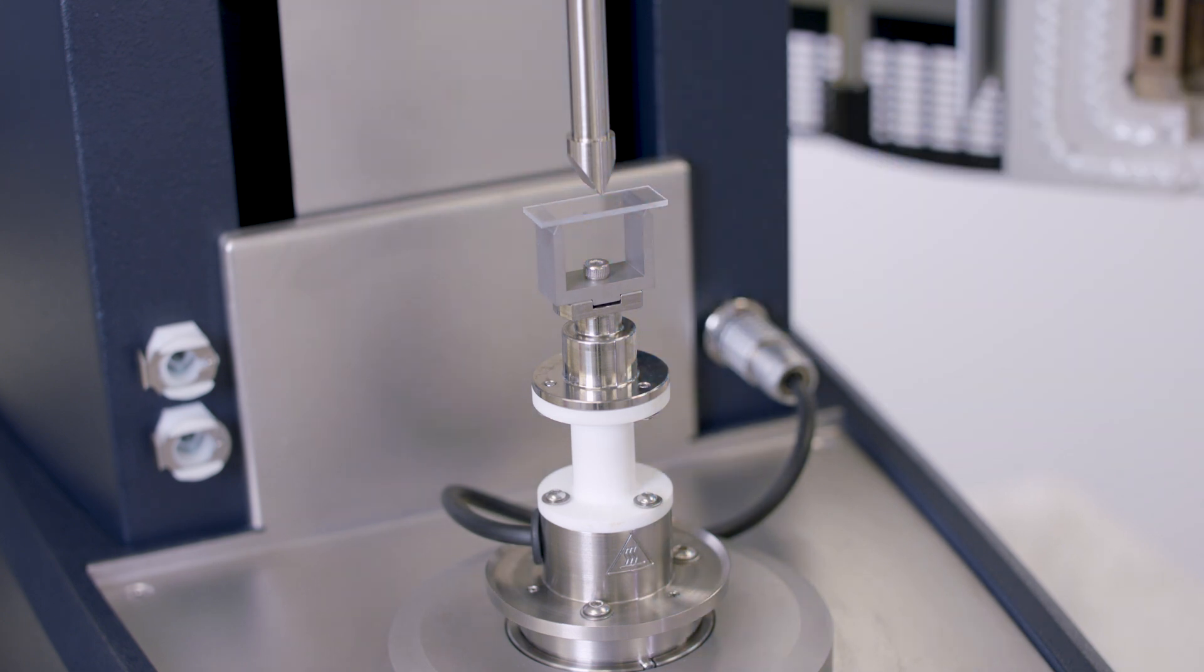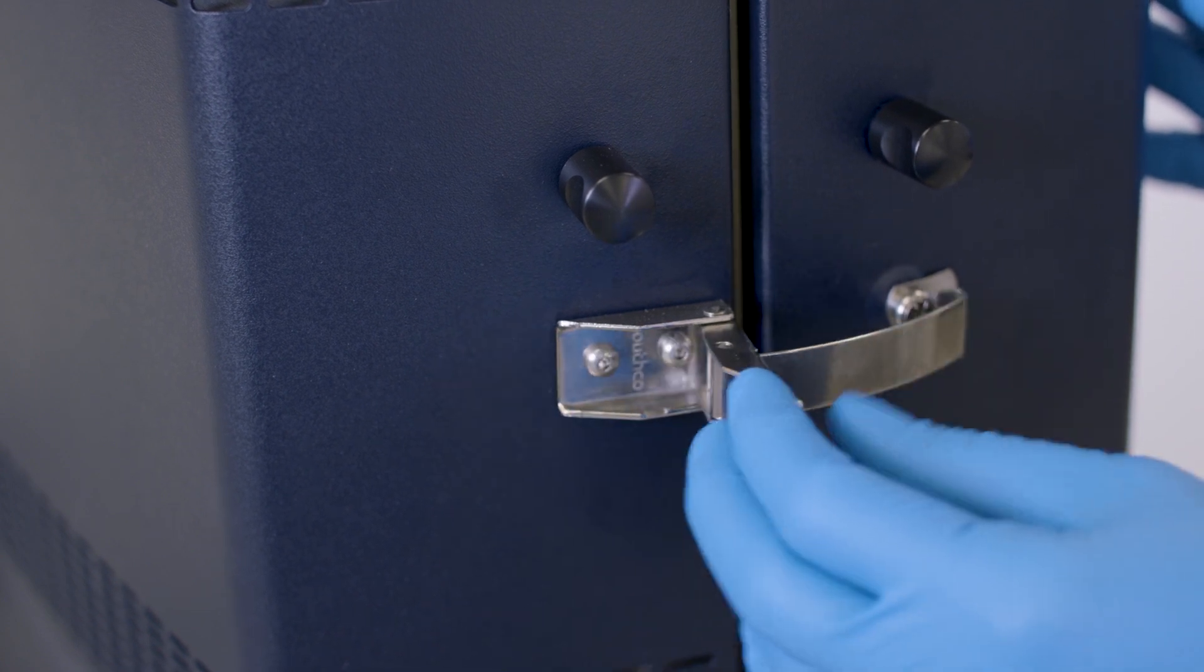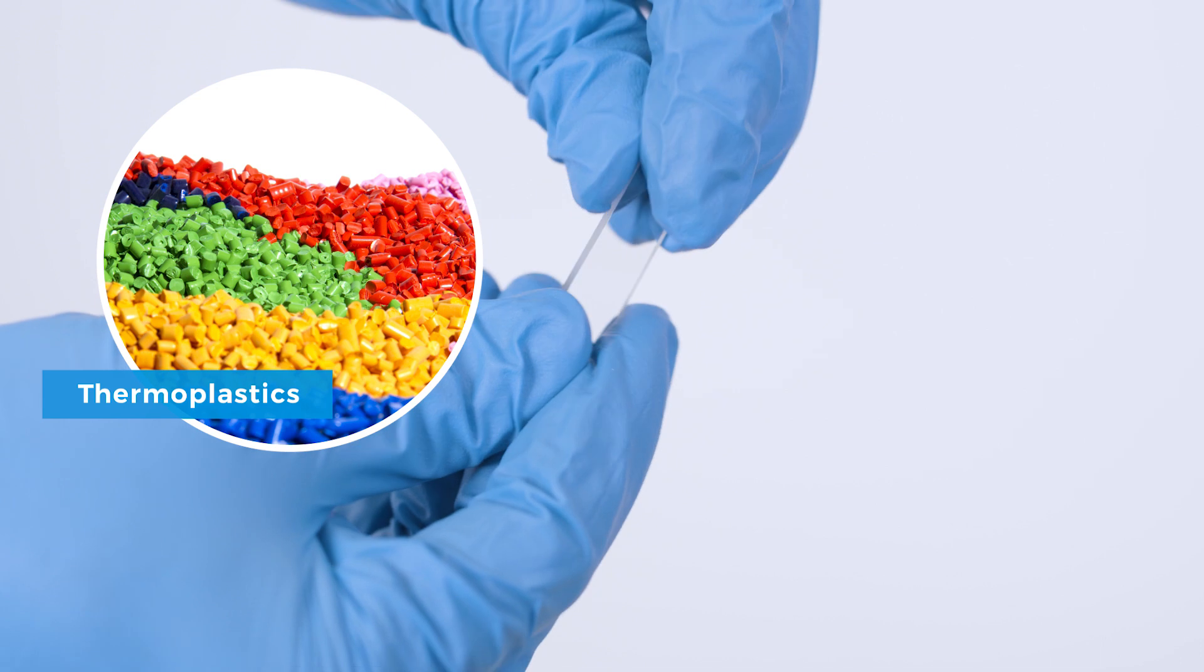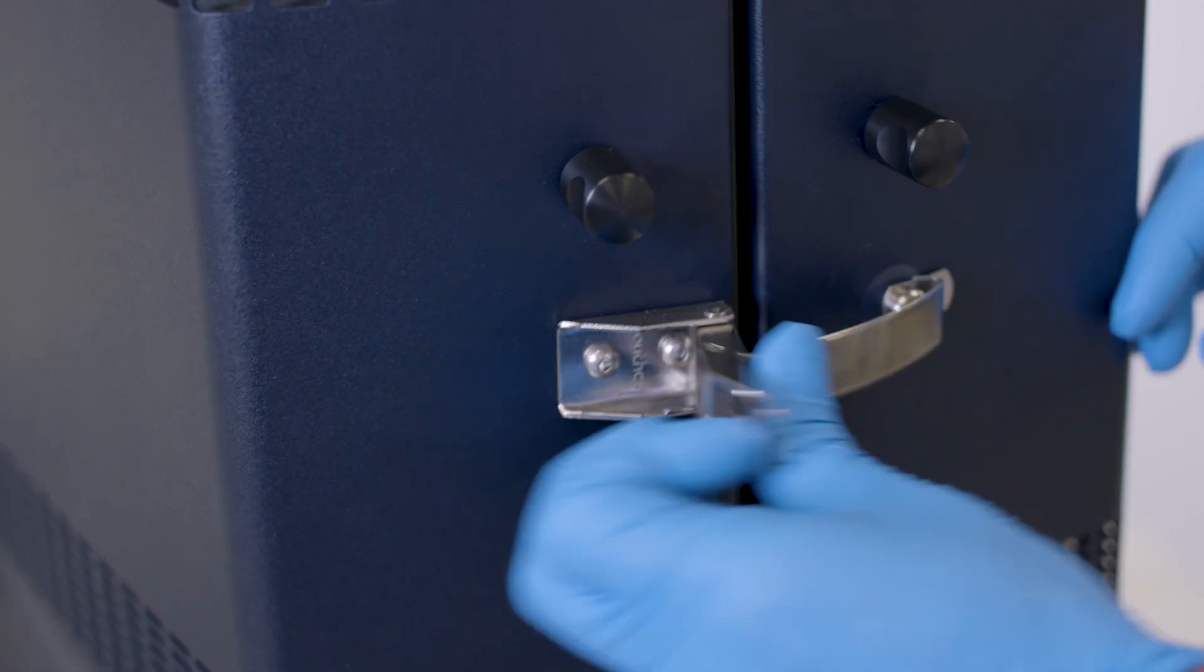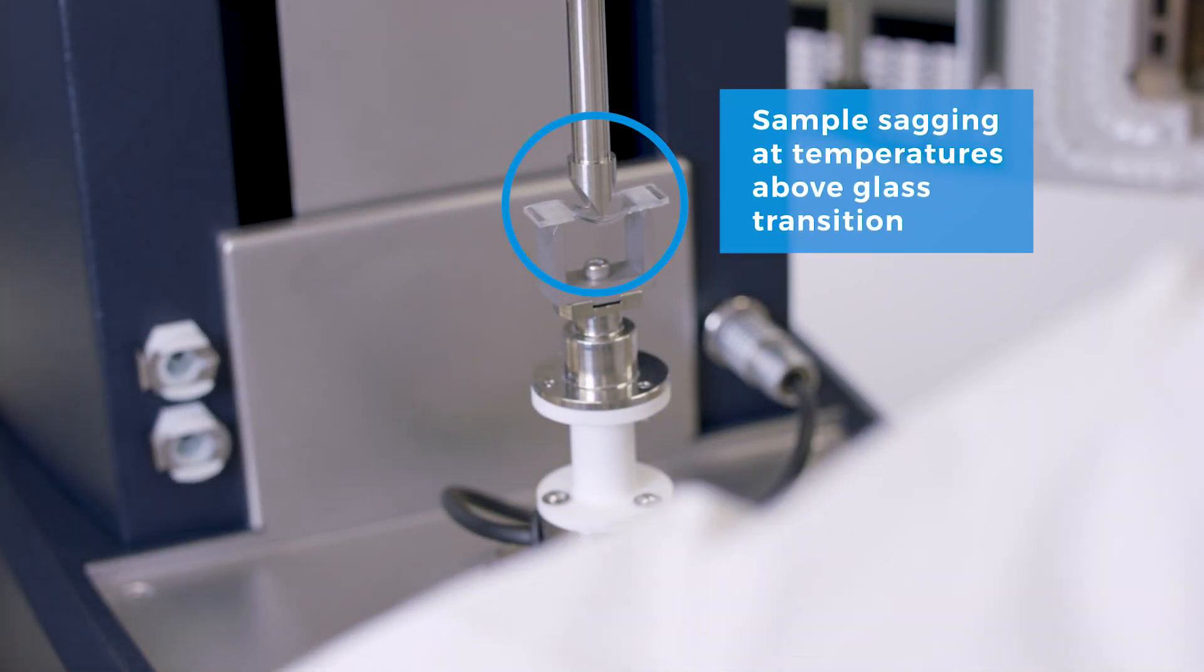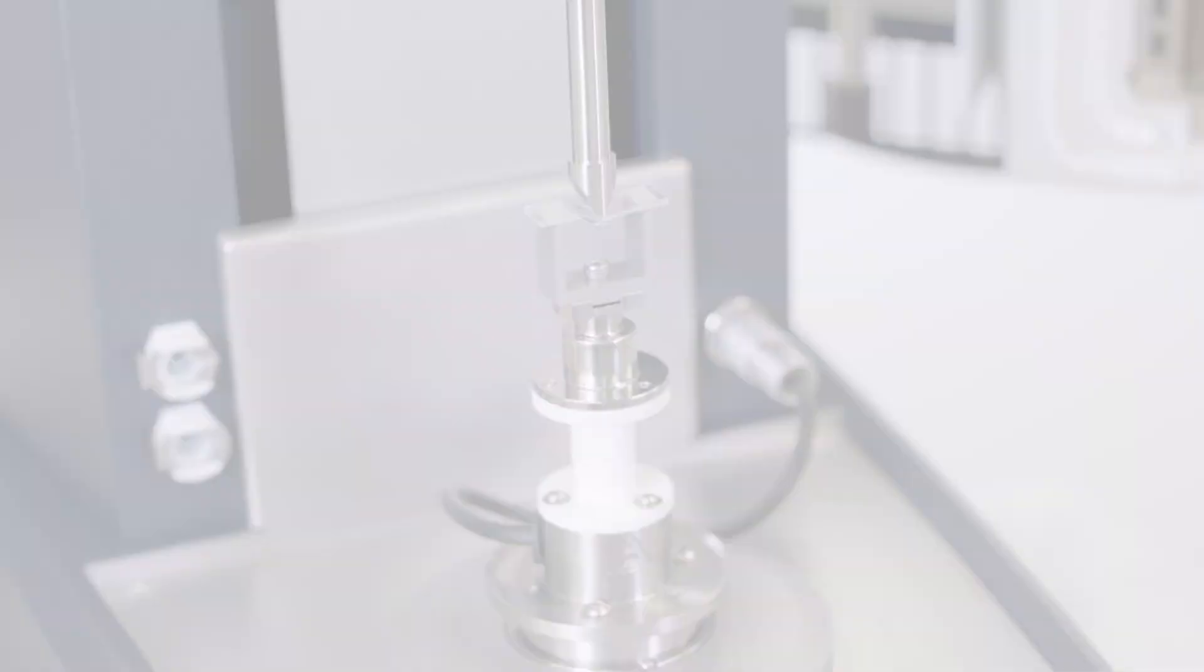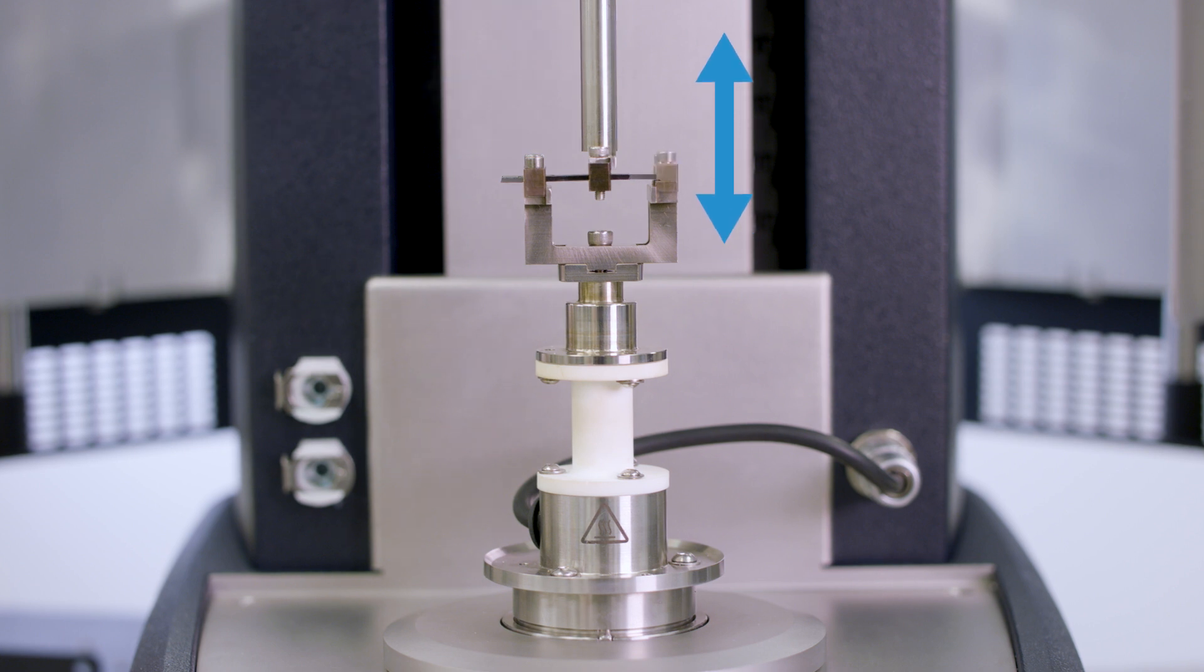Some materials tend to become relatively soft at temperatures above their glass transition. Examples include a sheet of rubber at room temperature or some thermoplastic materials at high temperatures. These type of samples will significantly sag during a temperature ramp experiment on three-point bending geometry. In these cases, the single or dual cantilever geometry offers an easy way to secure the sample and maintain its shape even at temperatures above the glass transition.